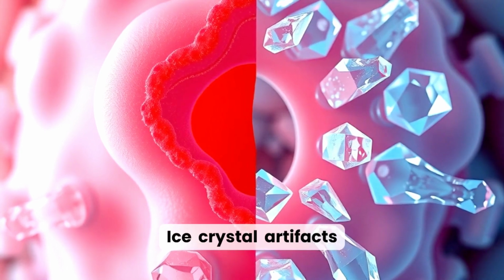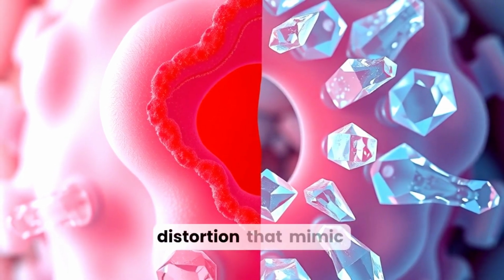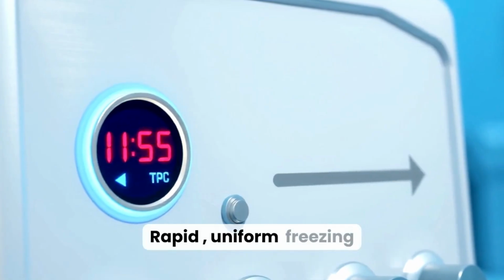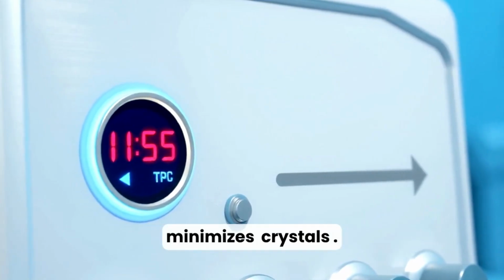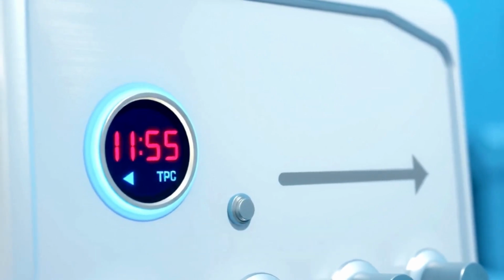Ice crystal artifacts form when freezing is slow or uneven and can create holes or distortion that mimic disease processes. Rapid, uniform freezing minimizes crystals. Temperature control in the cryostat is therefore essential to quality sections.